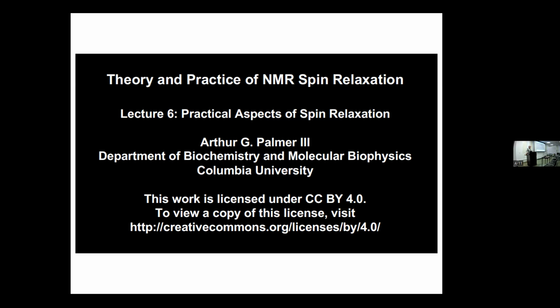So these are called SOFAST experiments. SOFAST HMQC basically has no recycle delay at all. And then there are variants of those. But what it's meant, of course, in practice is the real interest in relaxation rate constants is learning about dynamics of proteins. We talked some about the spectral density functions, et cetera.